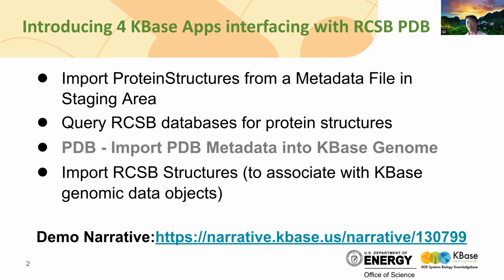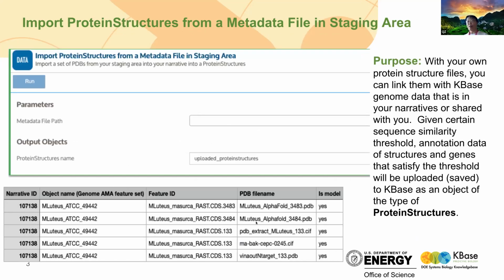So this is the last. I have my demo in this KBase narrative, so you can click on it and get into there. But before we get into there, I want to roughly go over the purpose of each app and what the input and output look like.